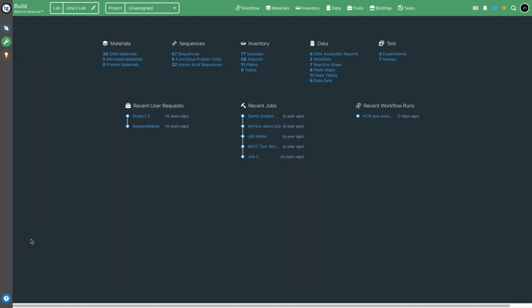So for starting, you can create lab groups. So lab groups act as siloed, distinct instances of the platform for work that must be isolated for security or intellectual property reasons. Normally, most companies start with a single lab group and add distinct labs only as the need arises. One common example might be different academic labs within a single department.